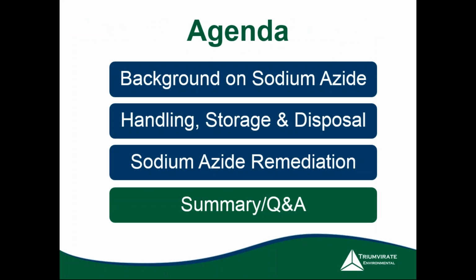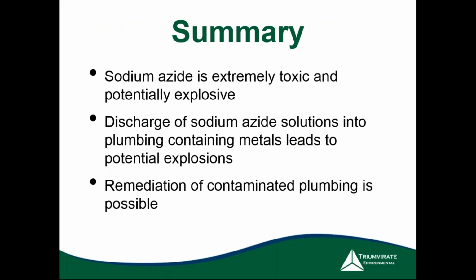So we'll have a brief summary, and then we'll get into Q&A. In summary, sodium azide is extremely toxic and potentially explosive. There's a couple different things that can lead to explosions: heating it, mixing it with strong acid, or coming in contact with transition metals, or even abrupt friction or shock can lead to sodium azide exploding.